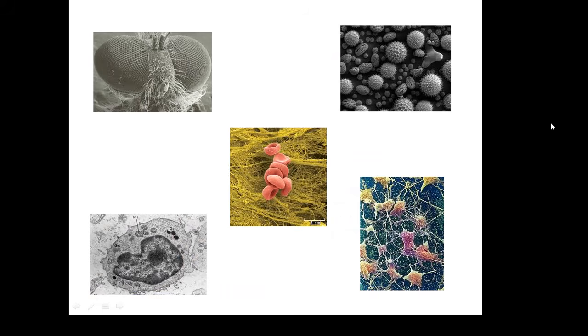Okay, and these are some electron micrographs, pictures taken with electron microscopes. The obvious difference is that you've got a much higher magnification, or you could say a much better resolution. Okay, much higher magnifications. Can you identify any of these?